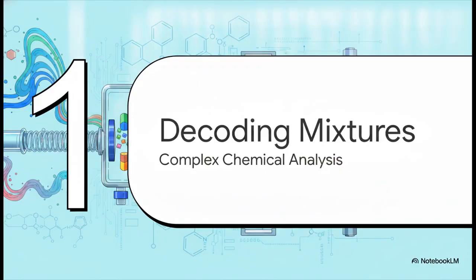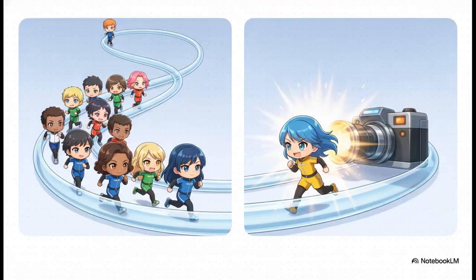Section 1, decoding complex chemical mixtures. To wrap your head around this, think of your complex chemical sample as a massive group of mixed-up runners in a relay race. The gas chromatograph, or GC, is basically the track. It separates the runners based on their volatility and their affinity for the track itself, essentially how fast they can run. Then, the mass spectrometer, the MS, acts as this ultra-high-speed camera at the finish line. It takes a unique molecular photo of every single runner to precisely identify them by their mass and charge.